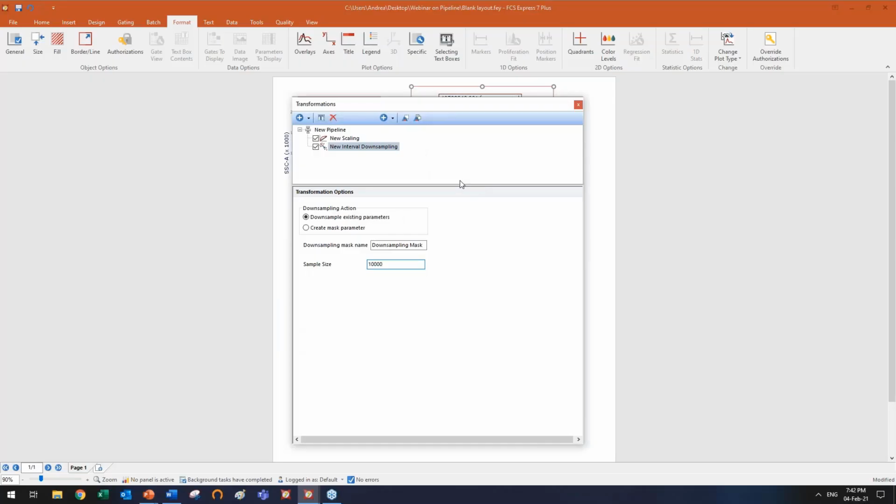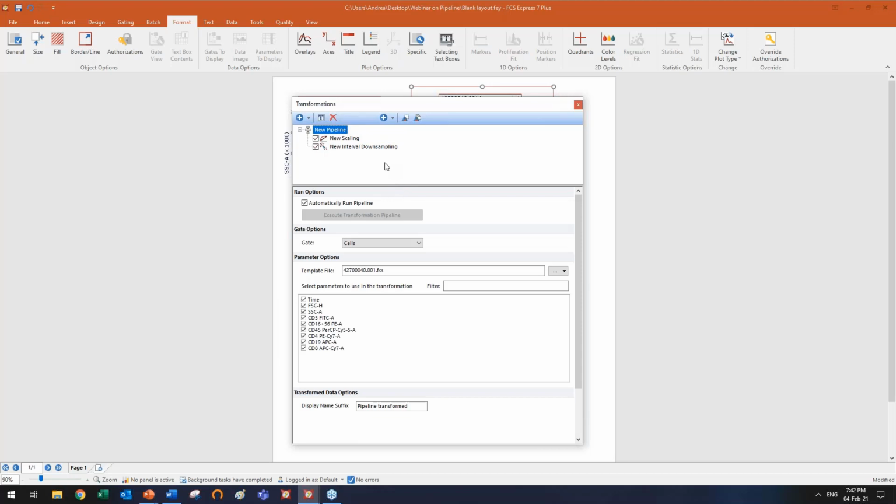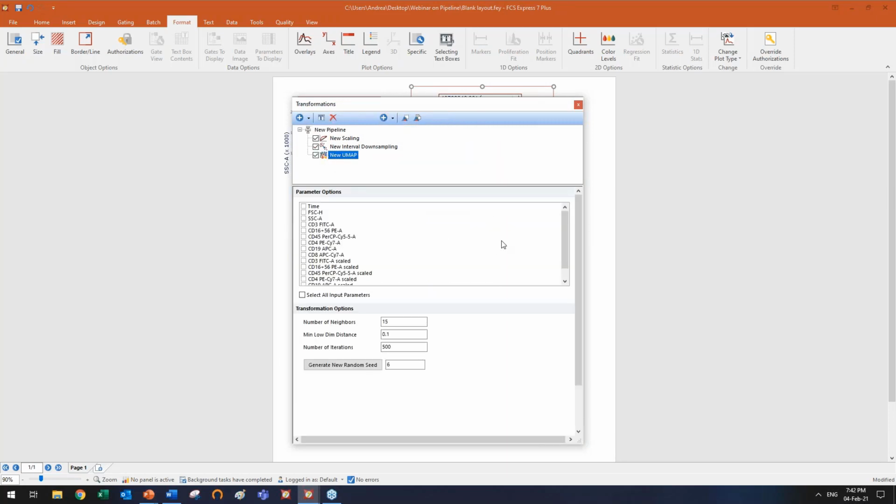And let's go here. So click on pipeline and click on the little plus drop down menu, go to dimensionality reduction, UMAP. And now you see that in the UMAP, we have access as possible input data to the original data, the unscaled, and the scaled data. So let's select all the scaled data, for example. We will not go into much detail with UMAP, but you see you can change a bunch of different options like the number of neighbors, the minimum distance in the low dimensional data set, and so on. But you see, UMAP is now just one step and it's very easy to add it.